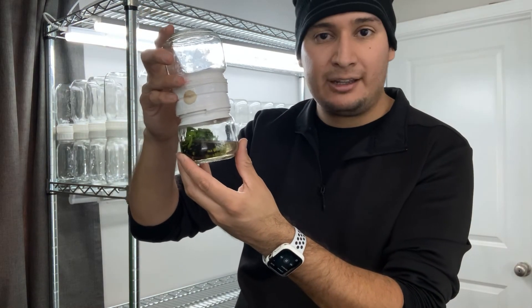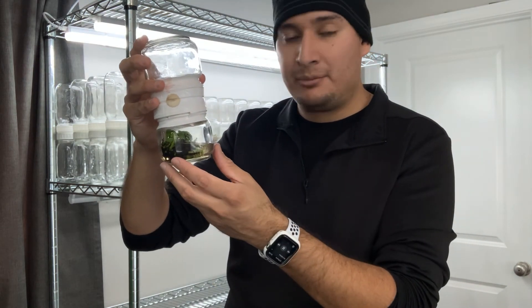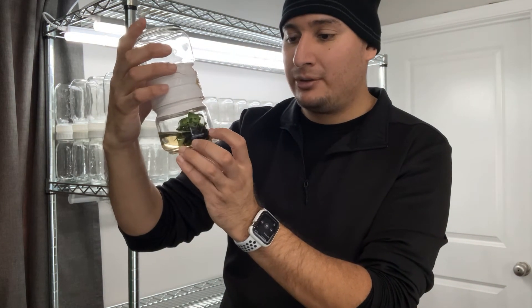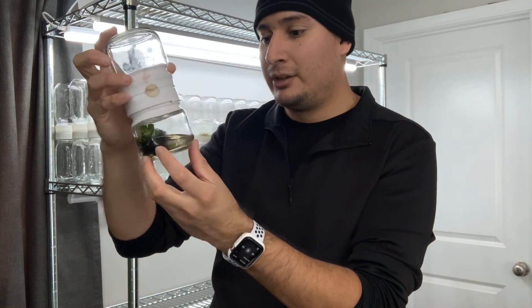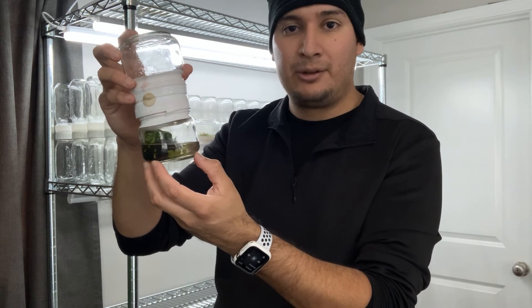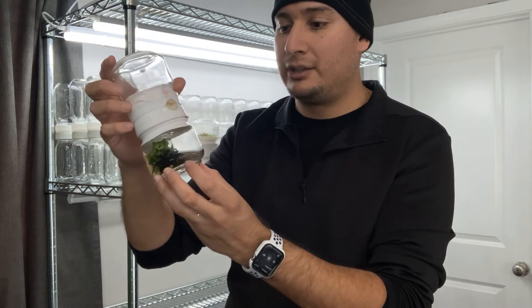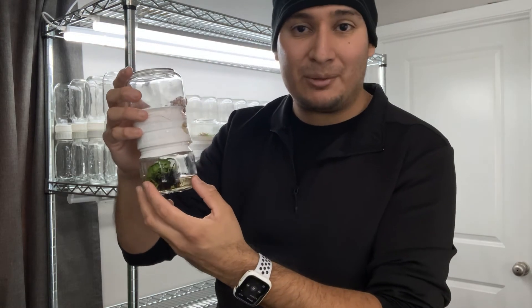I could add more BA or kinetin — which is a cytokinin — to increase the amount of multiplication, but I'm really happy with the balance I have between multiplication and rooting. I can basically take these plants out now and place them into sphagnum and they would be fine, but I still want to propagate more plants.